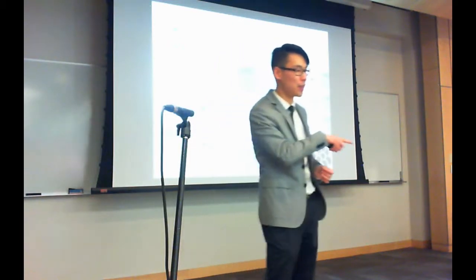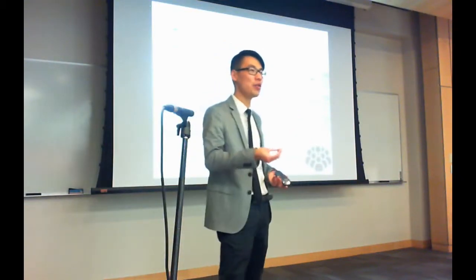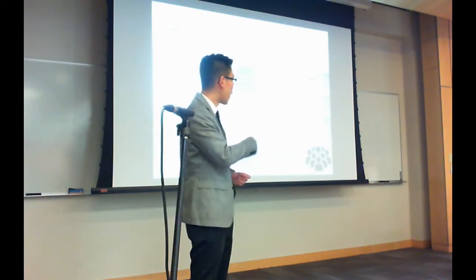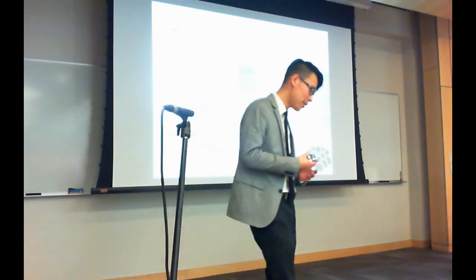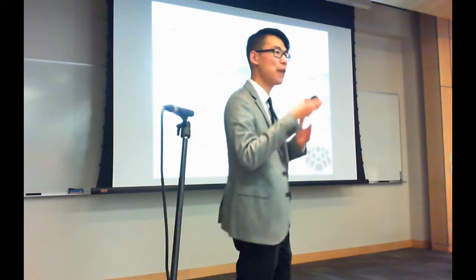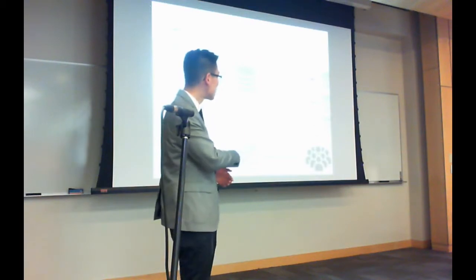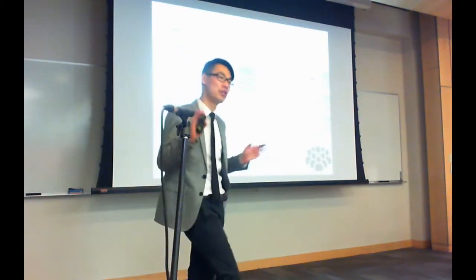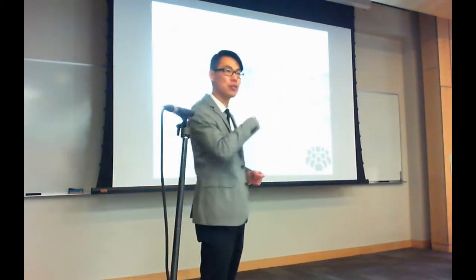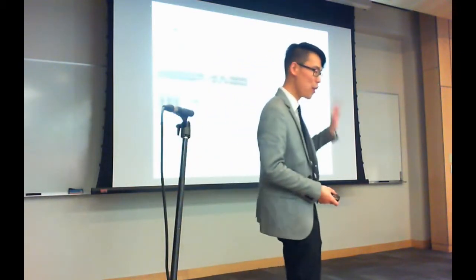And so if you made a discovery, something unexpected in your data, you can ask if the rest of the community also had the same observations. Beyond that, because we have full provenance of all the searches and how everything was added together, it empowers the community to reuse that information. They can customize how to analyze the data with new tools and different parameters, and they can reuse the exact same open library construction procedures to create their own boutique knowledge bases and libraries that they can download and search however they please.